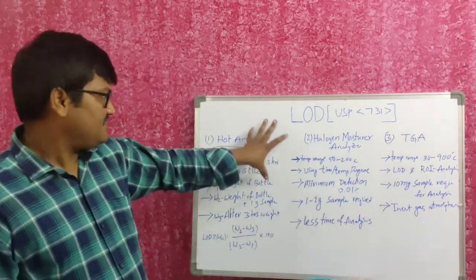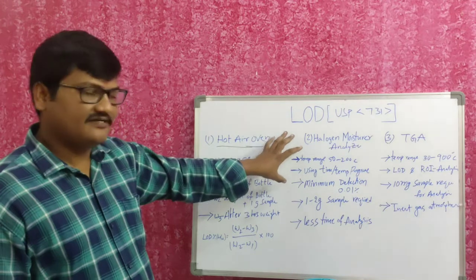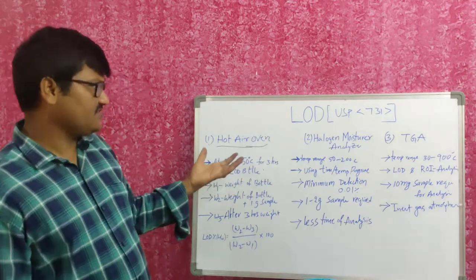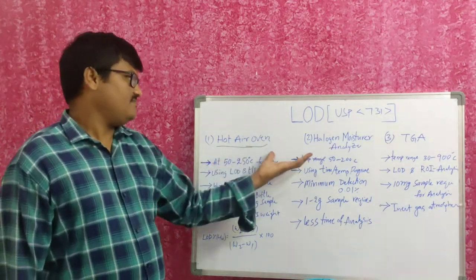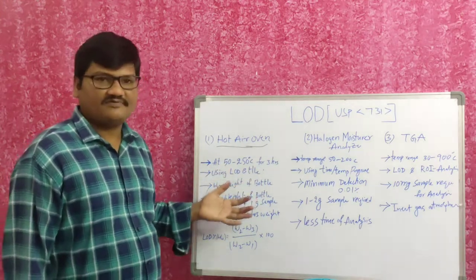Okay, this is about the loss on drying technique. By using these three methods, we can estimate the loss on drying of a pharmaceutical product.